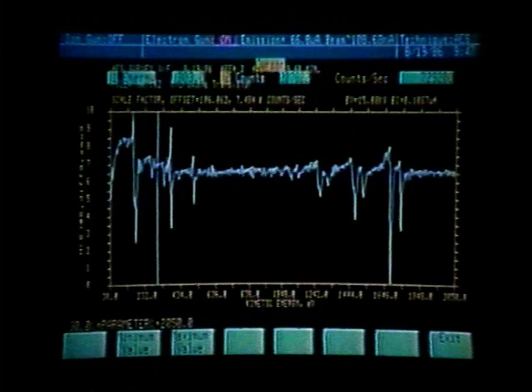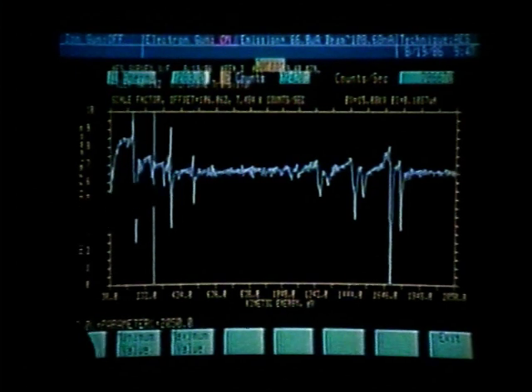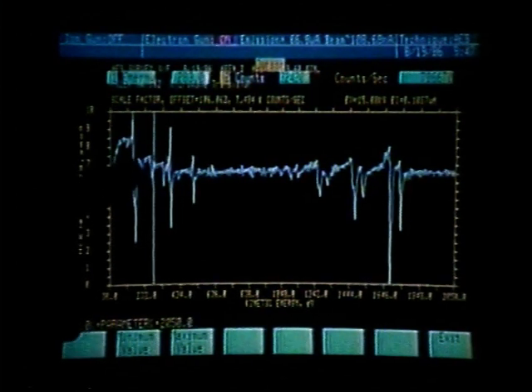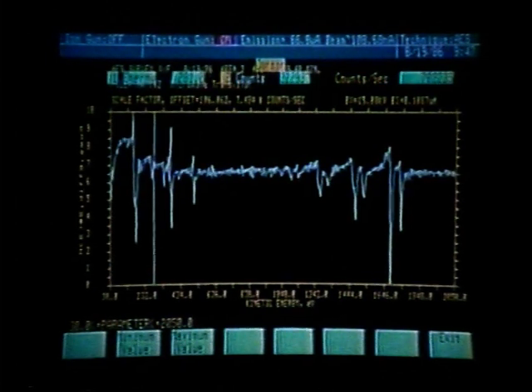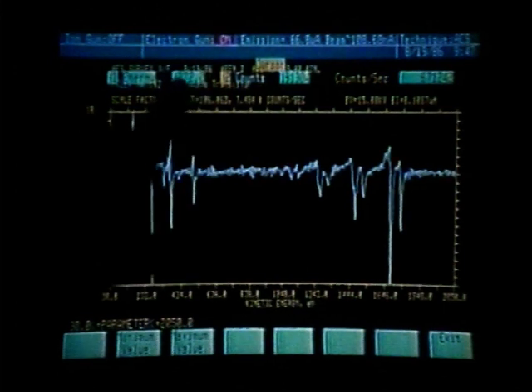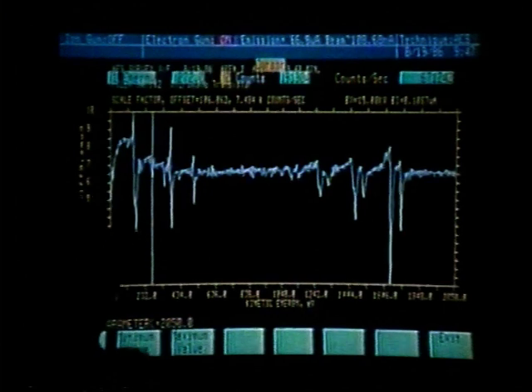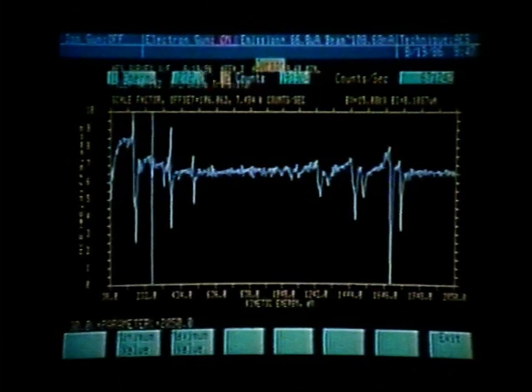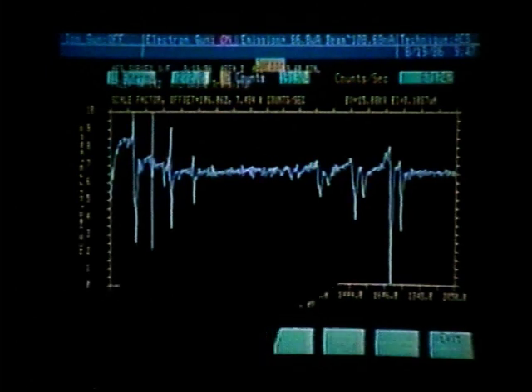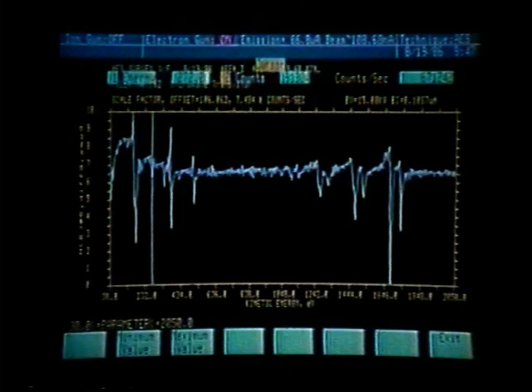The last major peak — the peak to the left of the nitrogen peak can be identified as a tantalum peak, but we have one more peak left. Finding its negative excursion at 191,000 counts with an energy of 272 — that turns out to be a carbon peak. We have now identified all of the peaks on this graph: tantalum being the major element, with a small amount of carbon, some nitrogen, and oxygen also present.